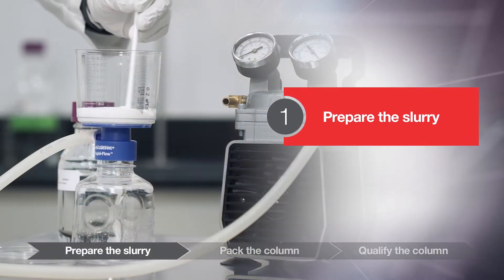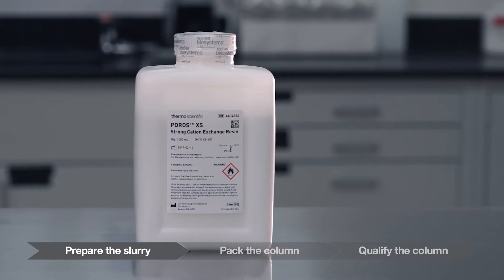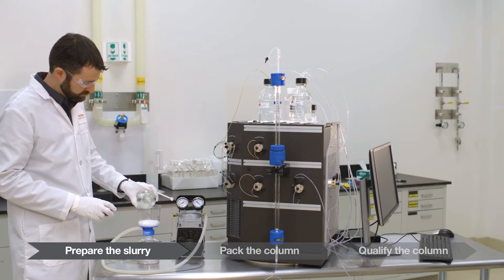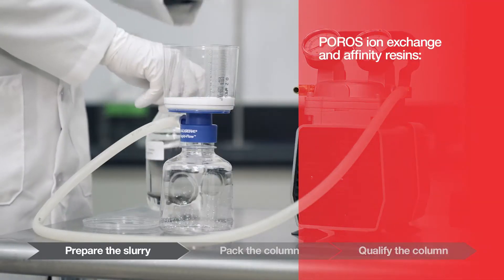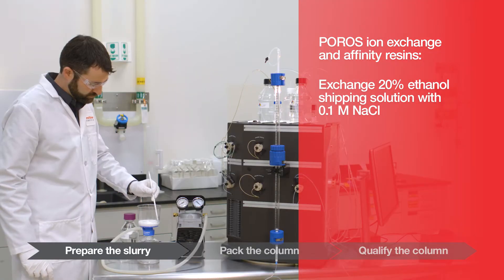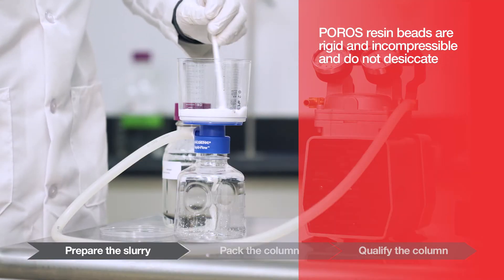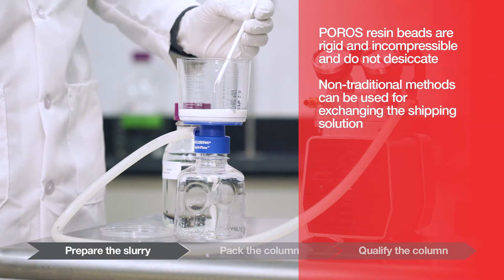Prepare the slurry. POROS resins are supplied in 20% ethanol or buffered ethanol. It is important to exchange the resin from the shipping solution into a packing solution in order to achieve consistent column packing results. For column packing POROS ion exchange and affinity resins, exchange the 20% ethanol shipping solution with a 0.1 molar sodium chloride solution. POROS resin beads are rigid and incompressible and do not desiccate; therefore, non-traditional methods can be used for exchanging the shipping solution.